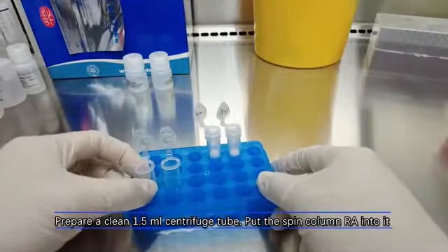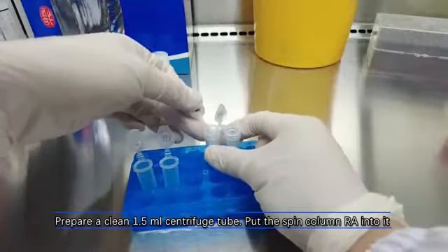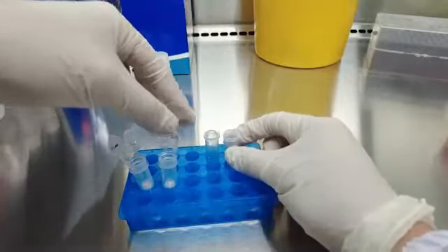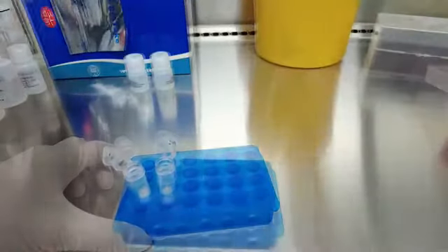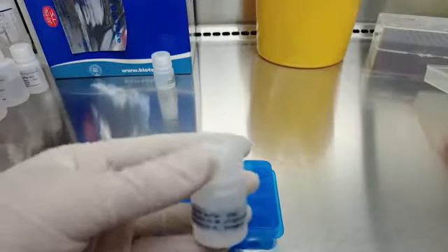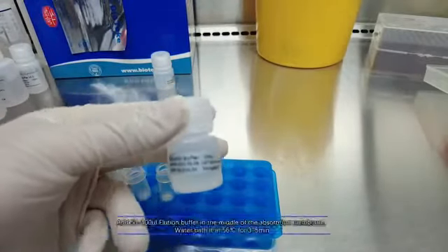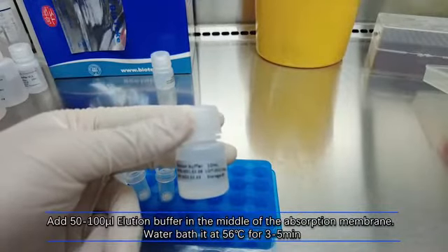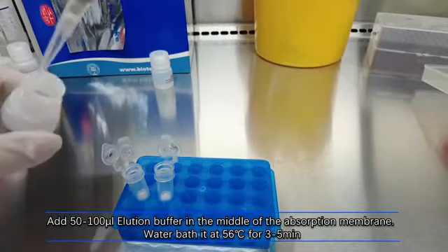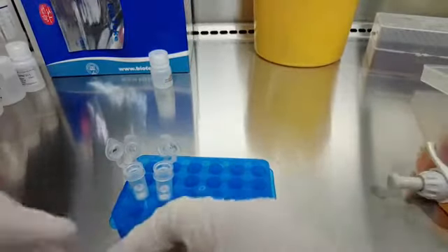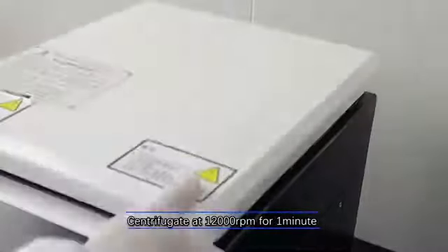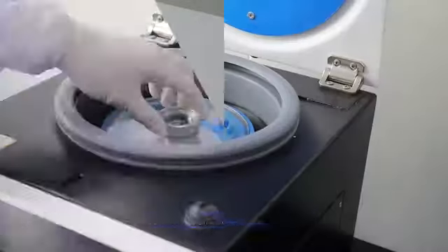Prepare a clean 1.5 ml centrifuge tube. Put the spin column I into it. Add 50 to 100 microliter elution buffer in the middle of the absorption membrane. Water bath it at 56 degrees centigrade for three to five minutes. Centrifugate at 12,000 revolutions per minute for two minutes.